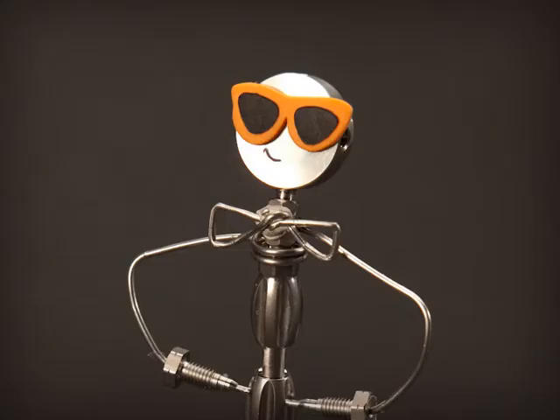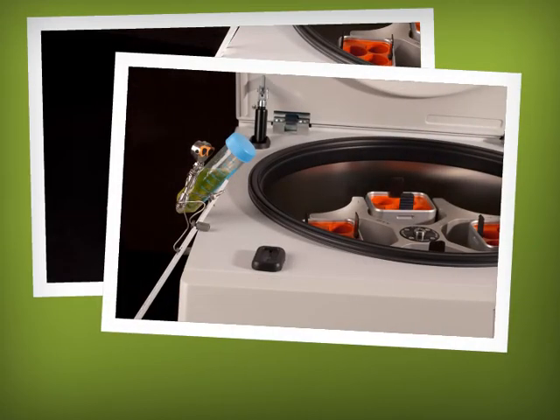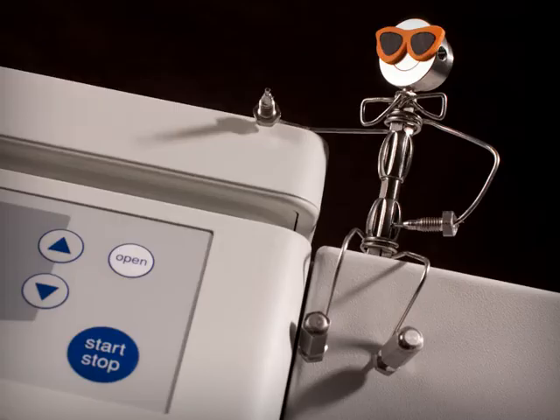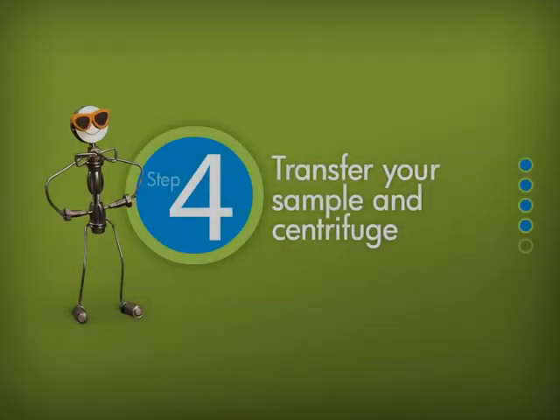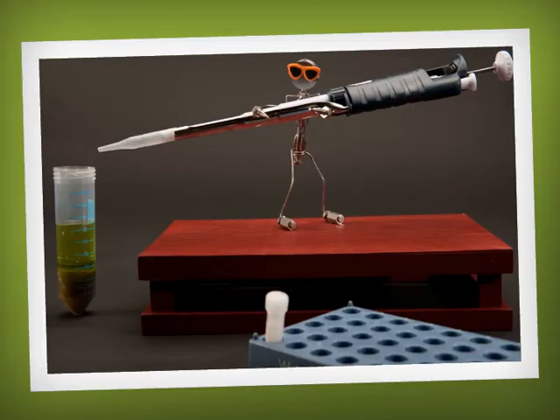Let's centrifuge Tube 1 — we need a solid sample plug and a clean extract. Wow, look at that: three distinct layers. The acetonitrile and aqueous layers separated because we used excess magnesium sulfate. Your analytes are in the acetonitrile layer.